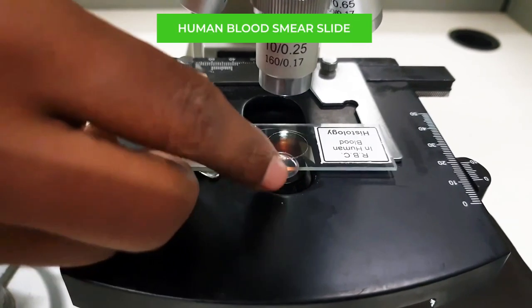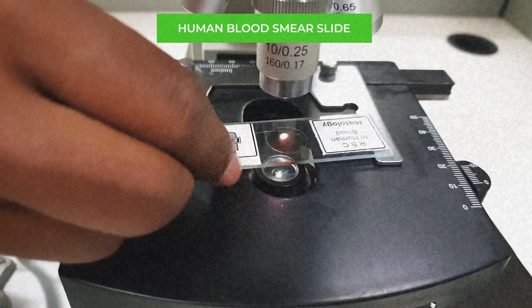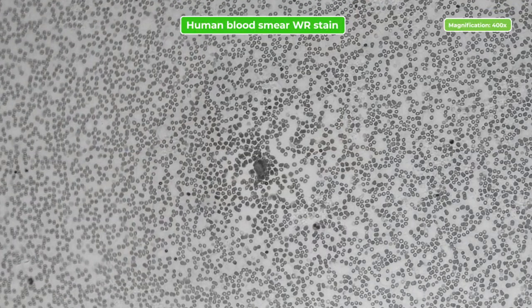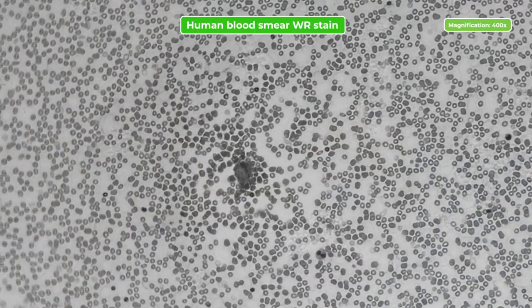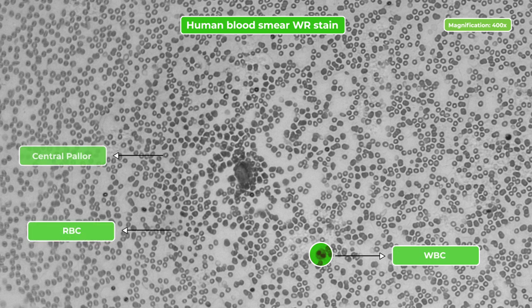By examining blood cells on the smear, lab technicians can diagnose various conditions. A specimen of human blood smear, stained with the right stain for better contrast between RBC, WBC and platelets, is imaged using the 50CUG at 400X magnification.